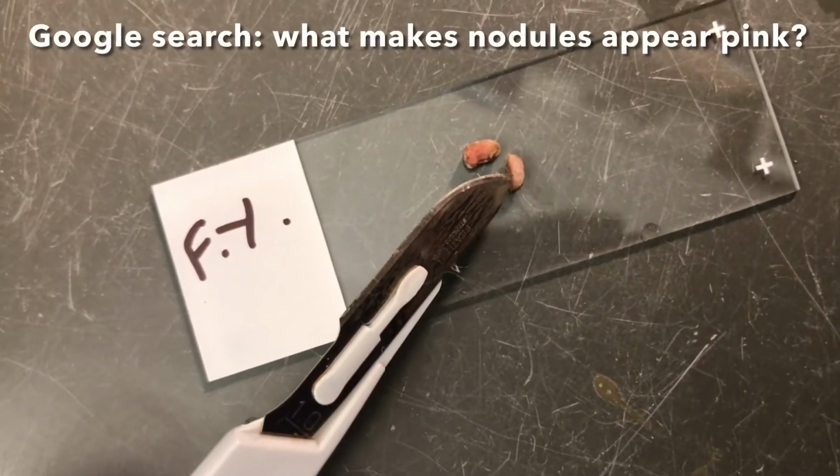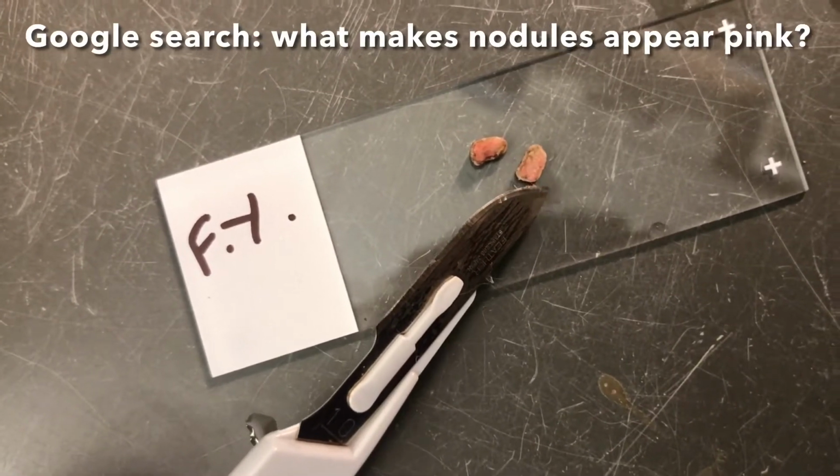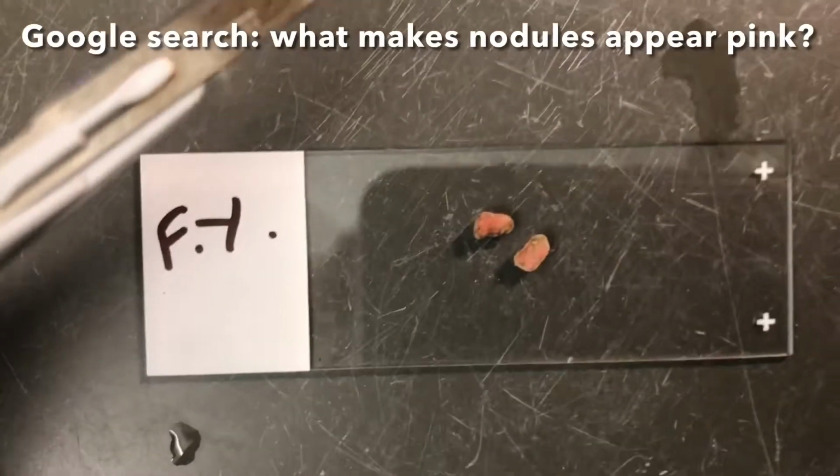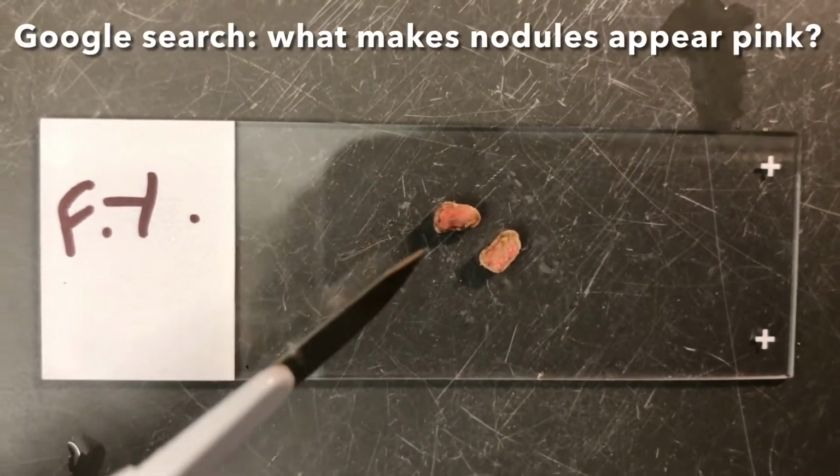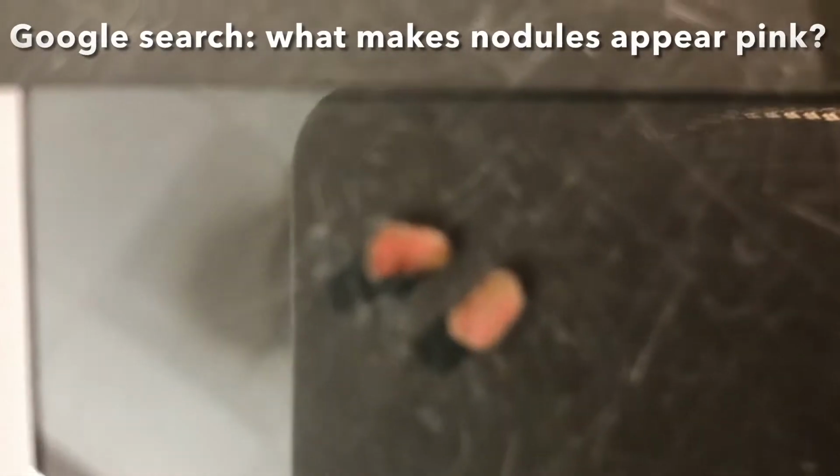So homework for you is, what makes the nodules look pink? What protein or what chemical structure makes the nodules look pink?